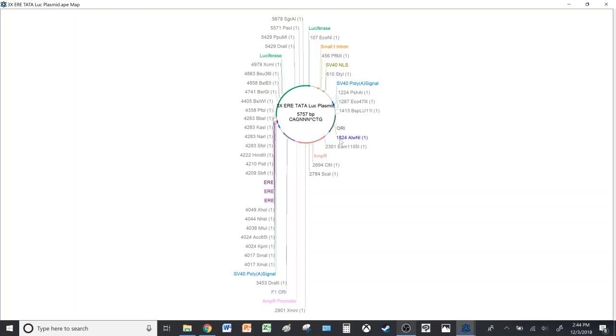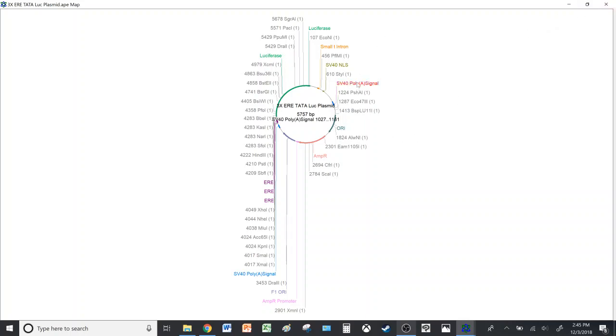So it might be a bit difficult to identify the cut sites with such a zoomed out picture. But for this demonstration, we'll take three enzymes so that the picture is a bit bigger and it's easier for us to see and we can decide which part we can cut.